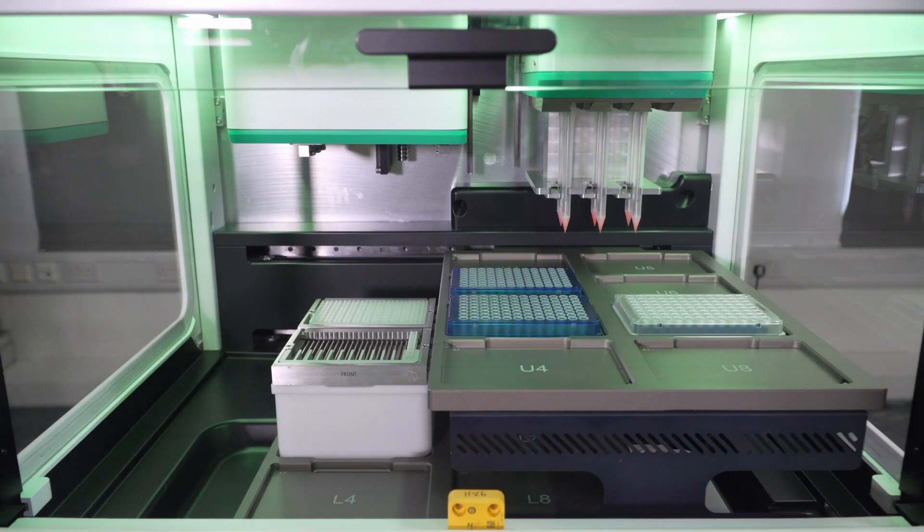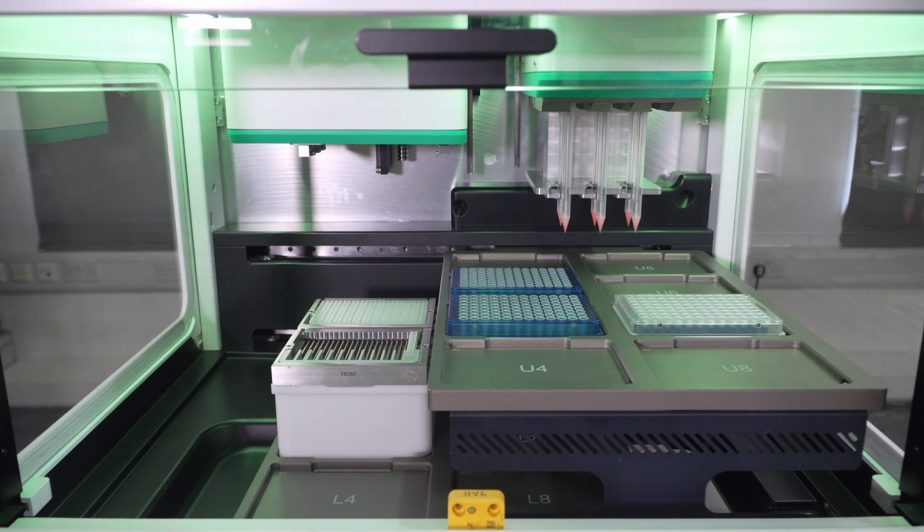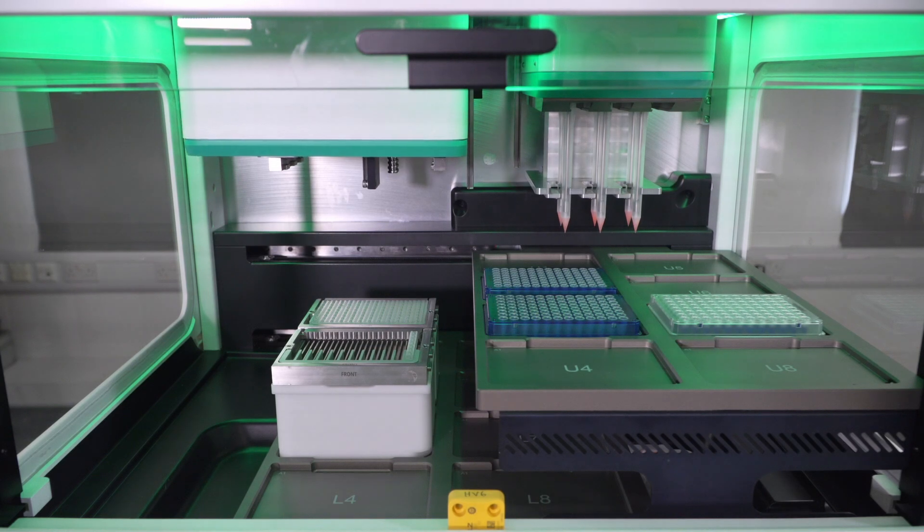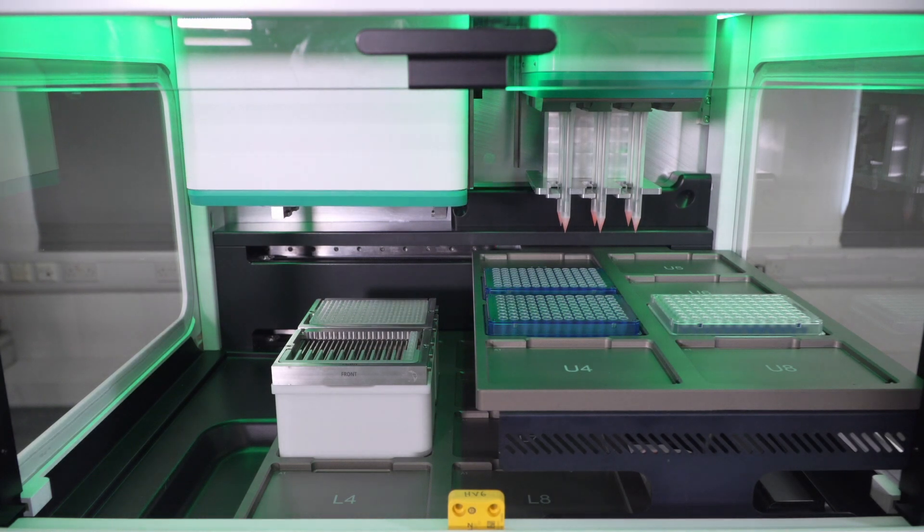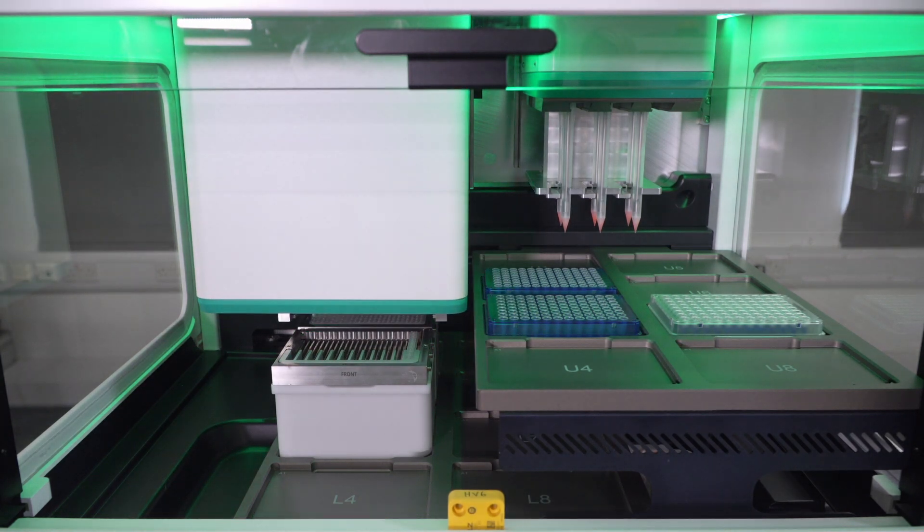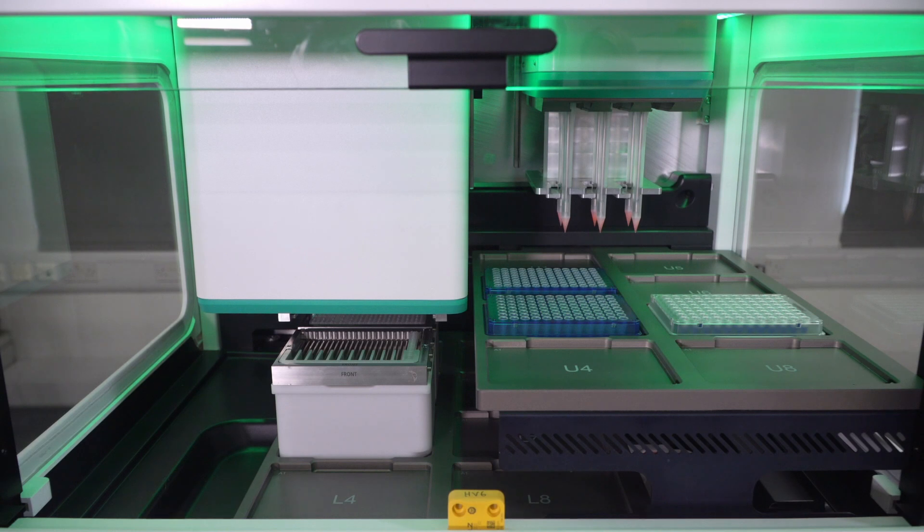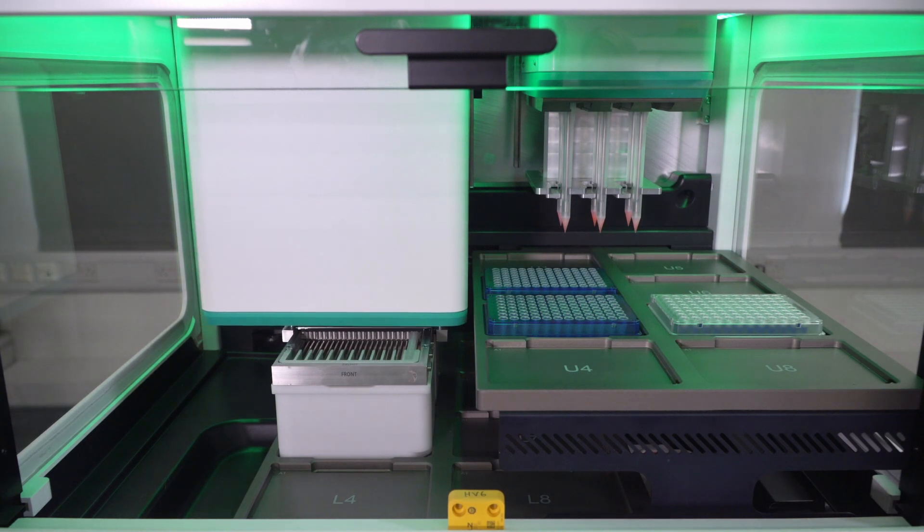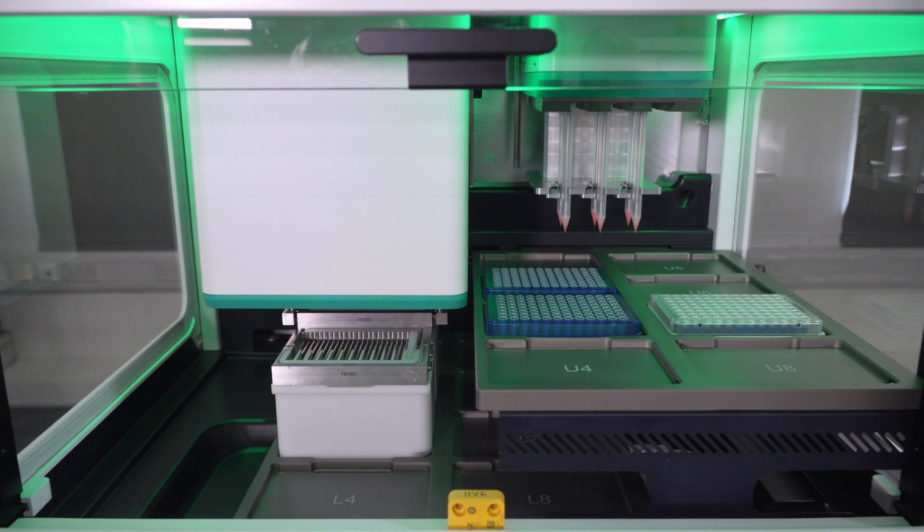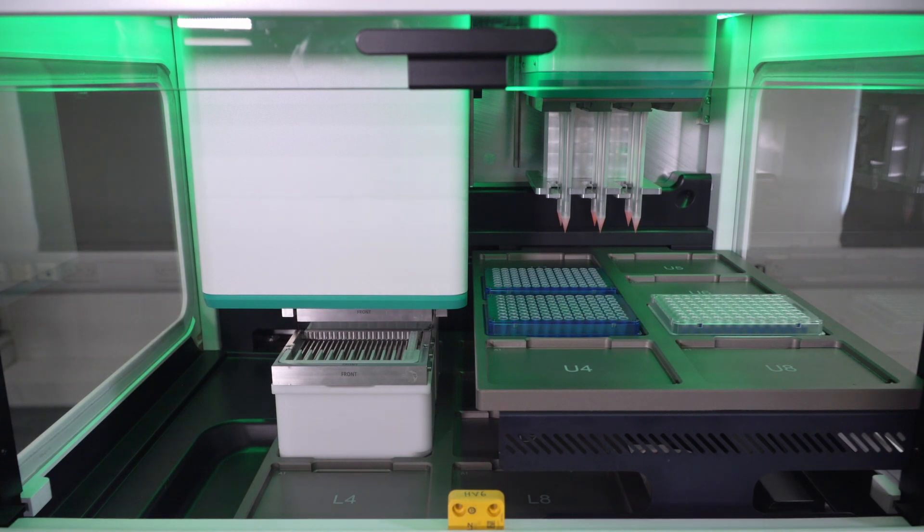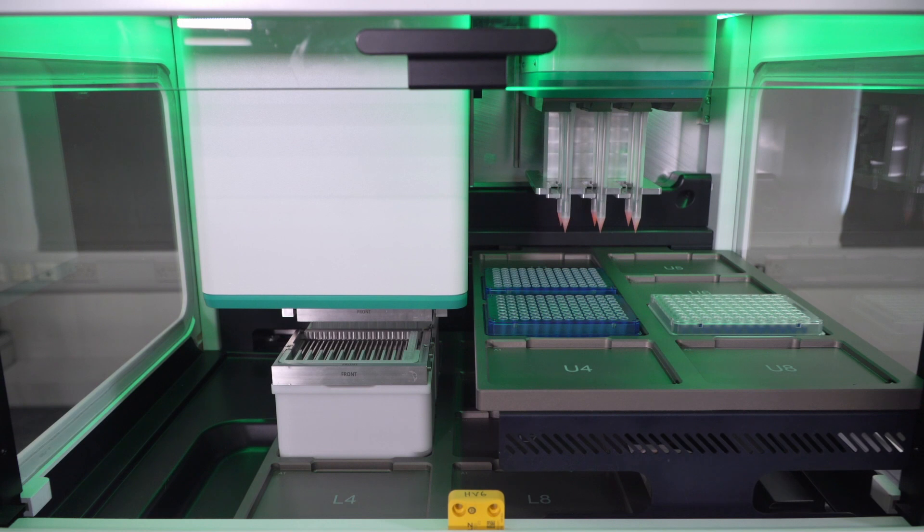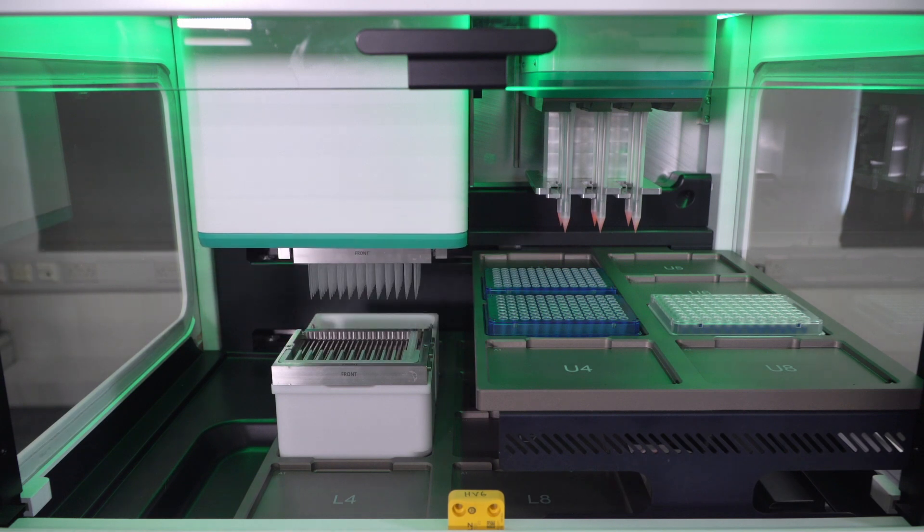I'm now going to initiate the pooling protocol by pressing play in the execute screen. And the first operation here is the pipetting head picking up a 96 array of tips. With these tips, the pipetting head will transfer some of the liquid from our source plate into an intermediate plate, where we would perform the pooling. Now you can see the tips are being picked up by the pipetting head.